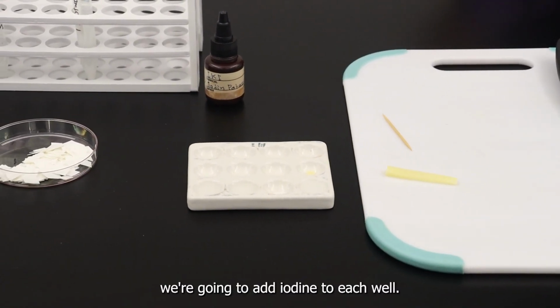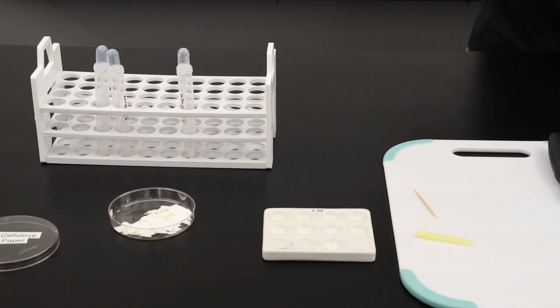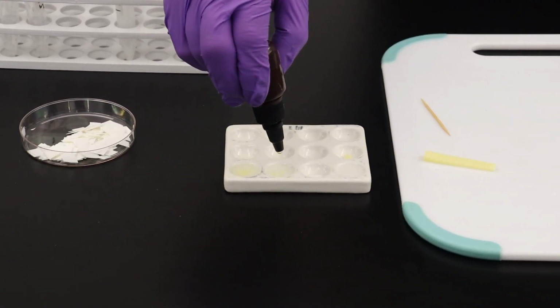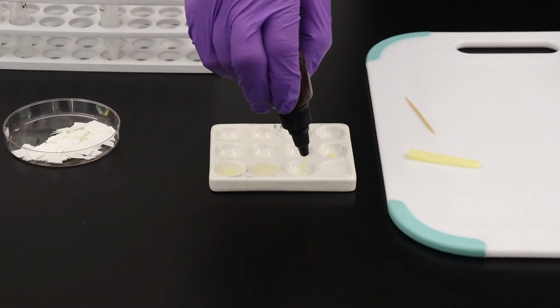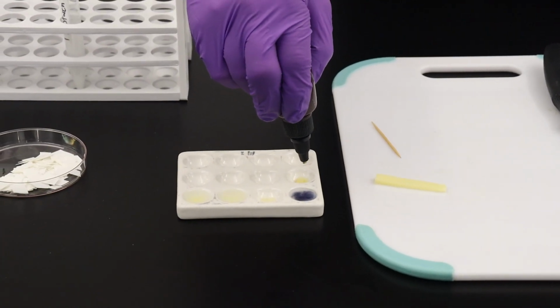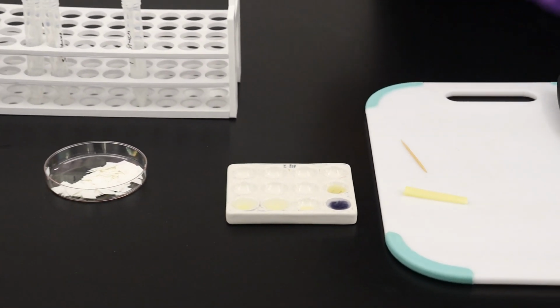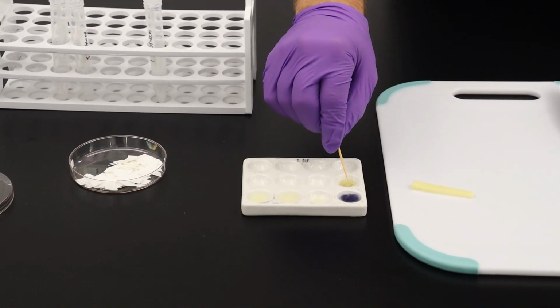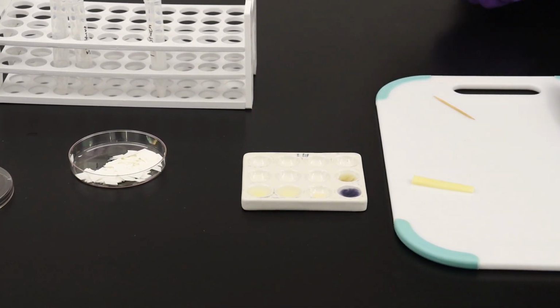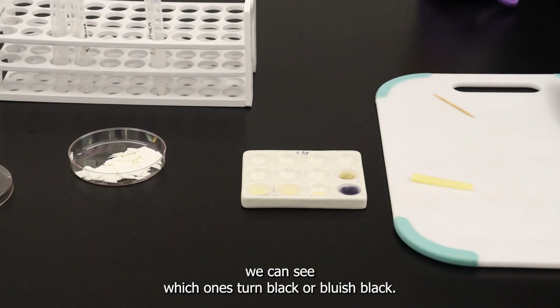Next, we're going to add the iodine to each well. If we take a look at the results, we can see which ones turned black or bluish black.